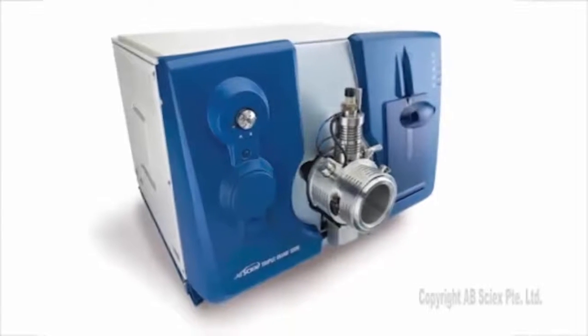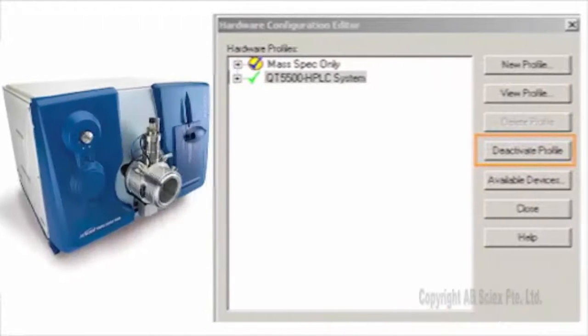Stop the sample flow and any ongoing scans. Deactivate the hardware configuration in Analyst software.